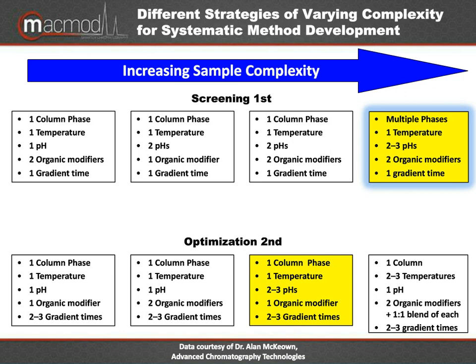Set your flow rate ideal for your particle size of interest. You try acetonitrile and methanol separately with your given pH, and that may be adequate to develop a separation after you optimize your gradient or move to the appropriate isocratic conditions.